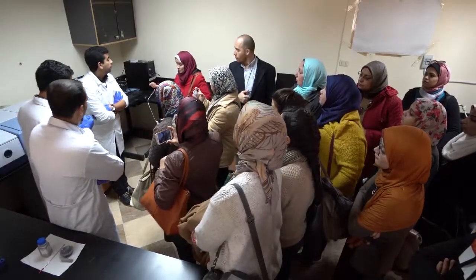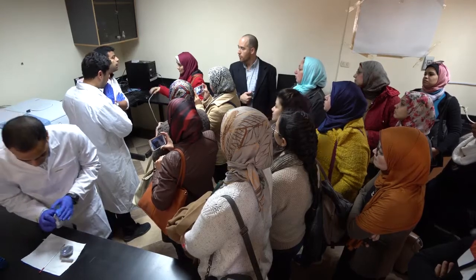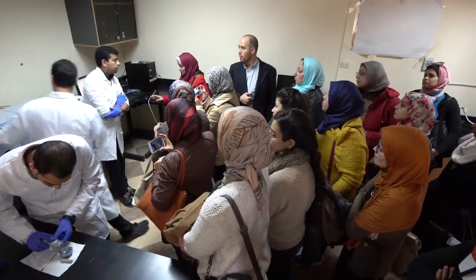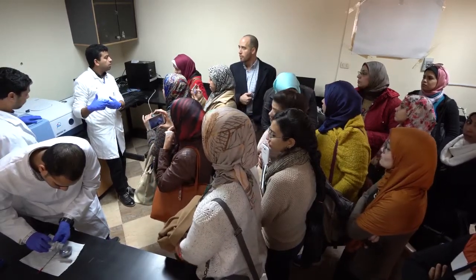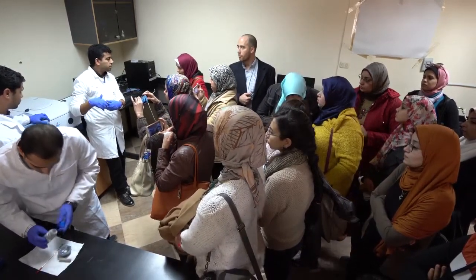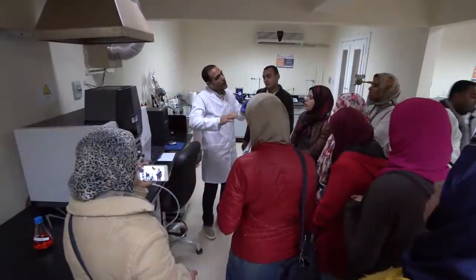Does this instrument connect with a microscope? Yeah, we can connect it. Yeah, we can add the microscope, an IR microscope, with this unit. Okay. With standard or without standard.